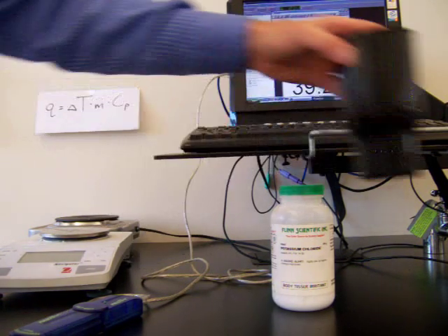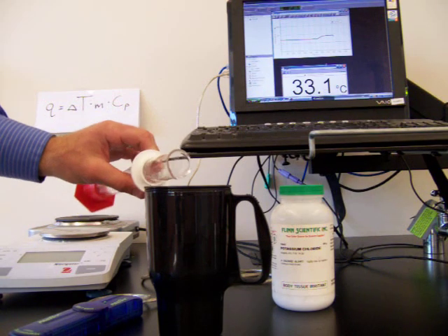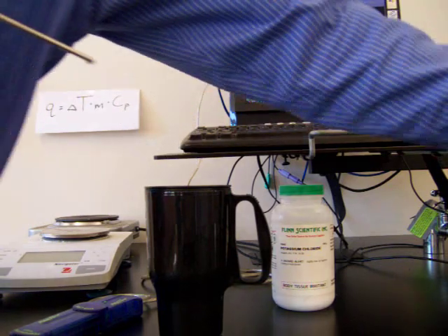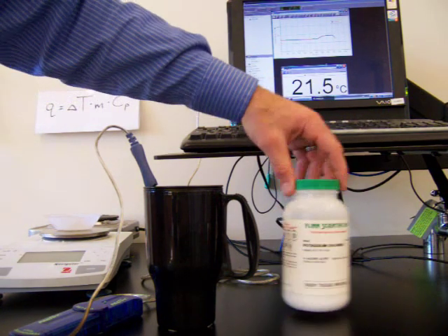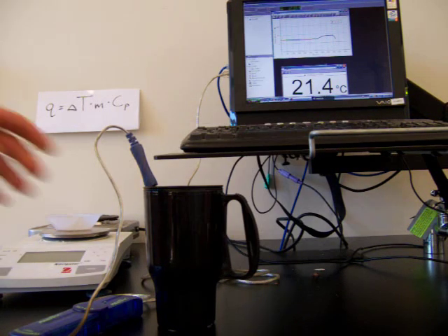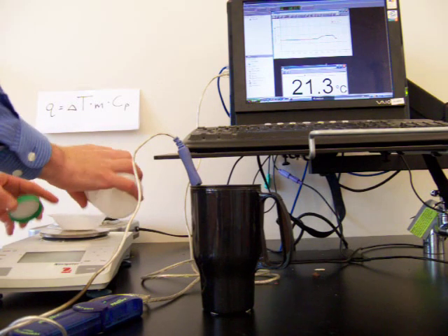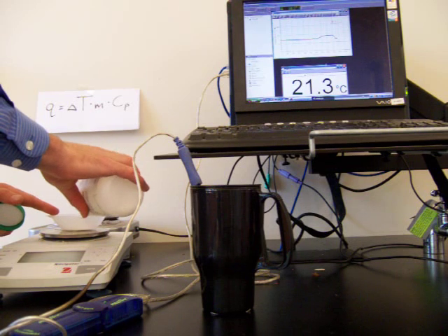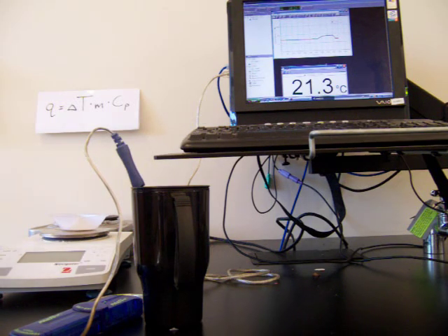Now we're going to try it again with a different salt. We'll set that calorimeter aside and get a new one. We'll take 75 milliliters of room temperature water again for our second calorimeter and find the initial temperature. This time we're going to be using potassium chloride for our second trial. I'll measure out a sample of potassium chloride. The initial temperature of our water is 21.3 degrees Celsius, and we have 5.98 grams of potassium chloride.